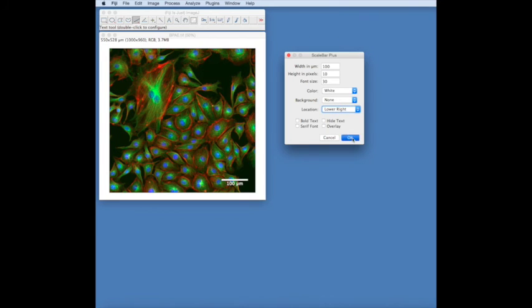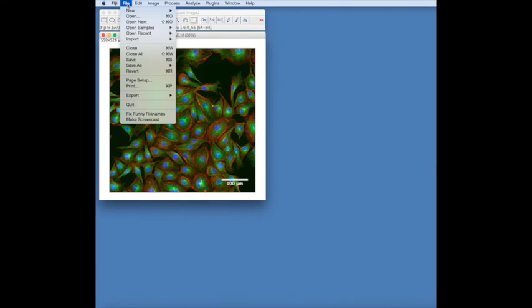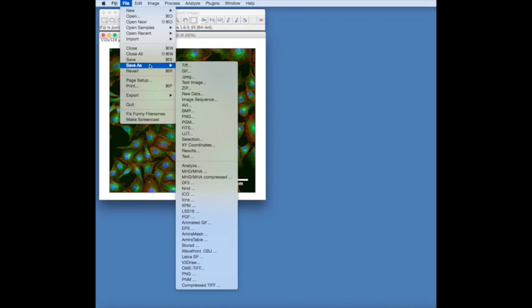Once you click OK, you have an image with a scale bar which you can then save.